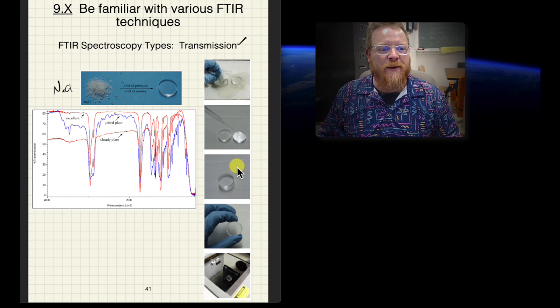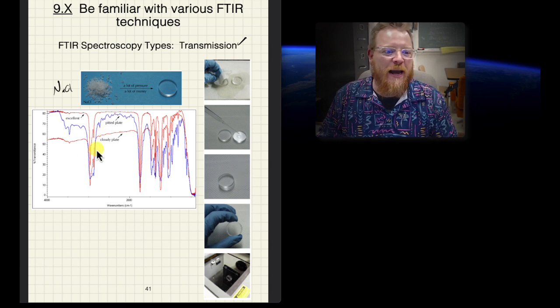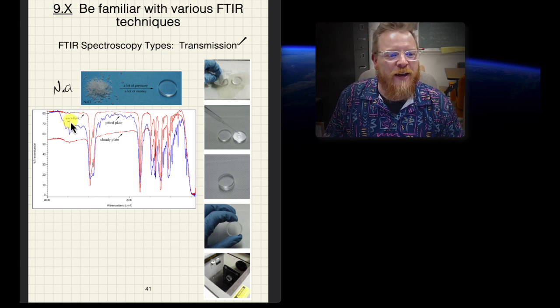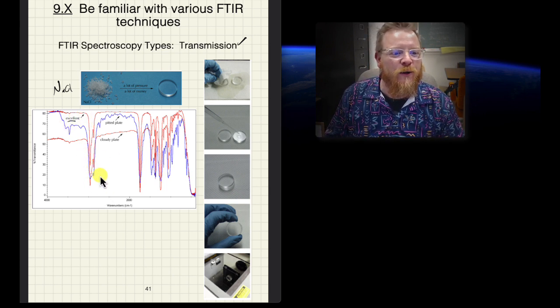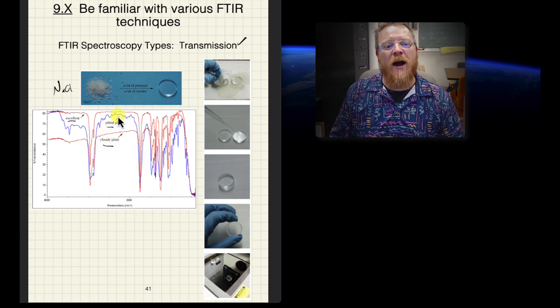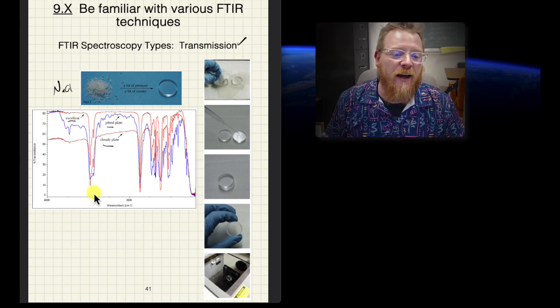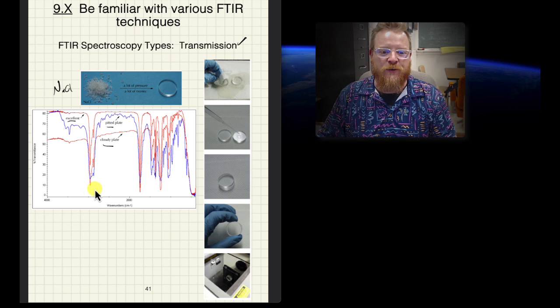and it can be quite messy. So for example, this is showing you what would happen to a spectra just from having what's classified as an excellent optic, or one that's maybe cloudy, or one that's pitted. So you can see this really has deleterious effects on your IR spectra.